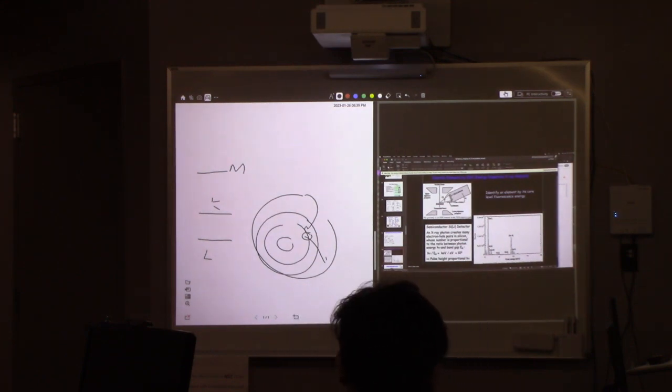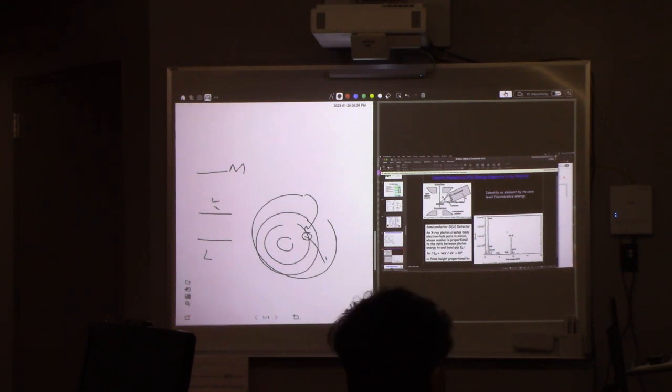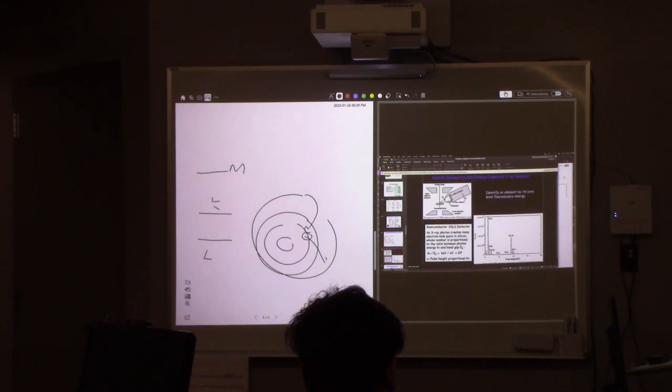So here this material has gallium, aluminum, gold, titanium, nickel, all these things. It's very simple, right? The software can pick up what it is from the corresponding energies. So it's a very neat technique. Today when I did my experiment, I saw chromium, selenium, then a very huge silicon peak because the sample was on a silicon substrate, right?